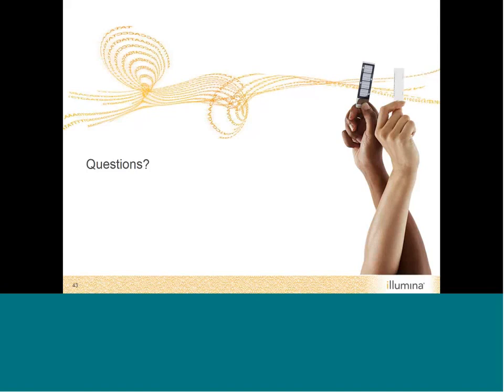Okay. And what algorithm do the workflows use for alignment? For the alignment, we use the Banded Smith-Waterman algorithm in the targeted region. Okay, and which variant caller is used? For the variant caller, we use the Illumina developed somatic variant caller.